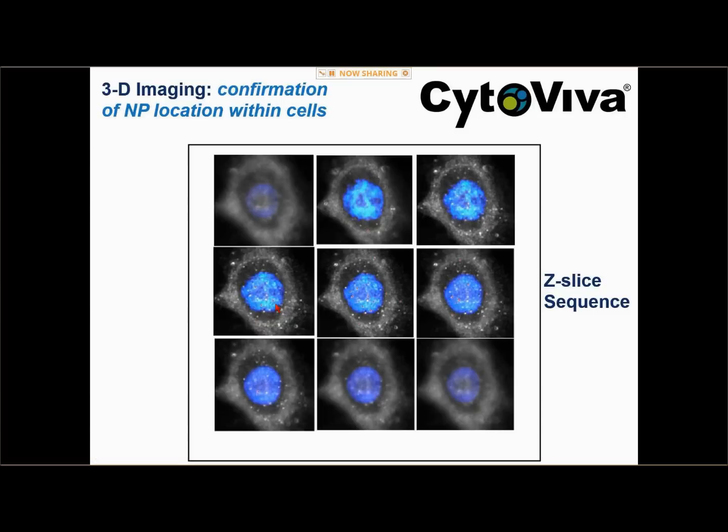this cell. And the DAPI nucleus actually outlines the nucleus in this cell, where we're using an algorithm that was developed with this 3D capability known as point of brightest voxel, which serves to identify the nanoparticles based on their brightness intensity in relationship to cell structure. If you'll recall from the earlier hyperspectral imaging that we looked at of the gold particles, and more specifically the carbon nanotubes, where we compared the carbon nanotube spectrum versus the spectrum of tissue, the carbon nanotube had much more intensity in its signal. And the case would also apply here with the gold as well.